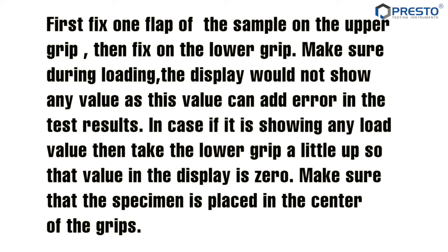First, fix one flap of the sample on the upper grip, then fix it on the lower grip. Make sure during loading the display does not show any value, as this value can add error in the test results. In case it is showing any load value, take the lower grip a little up so that the value in the display is zero. Make sure that the specimen is placed in the center of the grips.